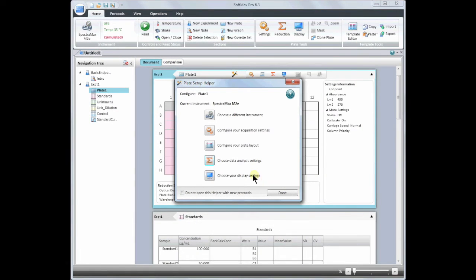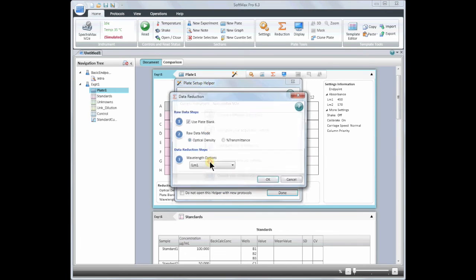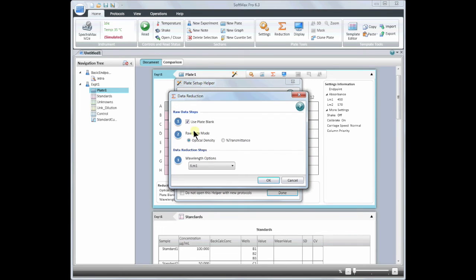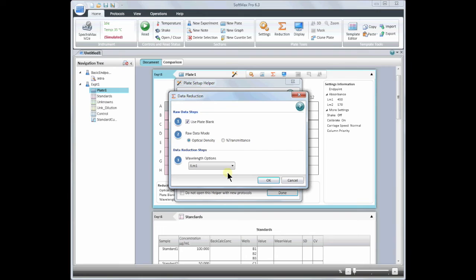Next we will choose data analysis settings. Here you can decide whether or not to apply the plate blank, change your raw data mode, or change your wavelength options. In this example, I am reading at two different wavelengths.